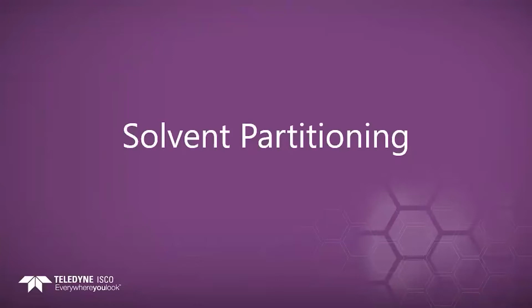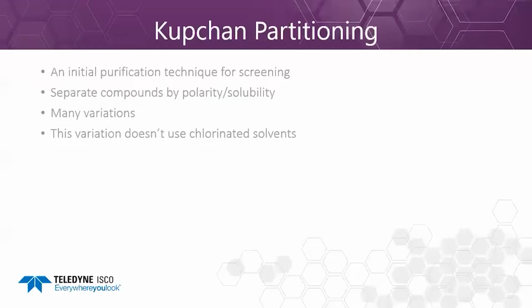Solvent partitioning is a very fast cleanup technique. The most common type of solvent partitioning is called Kupchan partition. Kupchan has many variations of solvents for partition and extraction. We will discuss a version that avoids chlorinated solvent. It is a very good purification technique for screening. It separates compounds by polarity and solubility.